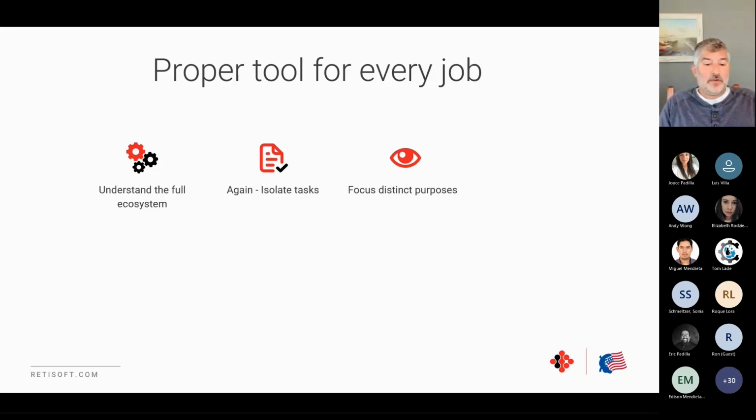It is important when selecting tools to keep focused on the primary purpose of that tool. So what is that big task? Don't stray into other nice to haves. Nothing else matters when you're looking at that primary thing. So if you're looking at an inventory solution as an example, a lot of them will have connectors for scanning and all sorts of things. But if the basic inventory doesn't accomplish your needs for inventory, then it doesn't matter what other bells and whistles it has.